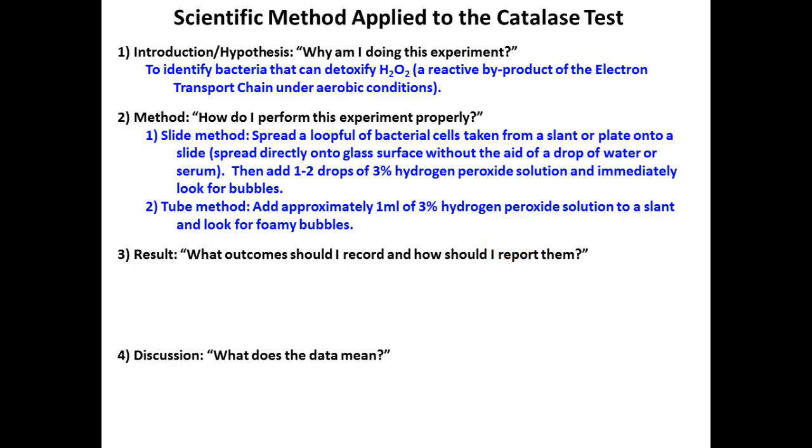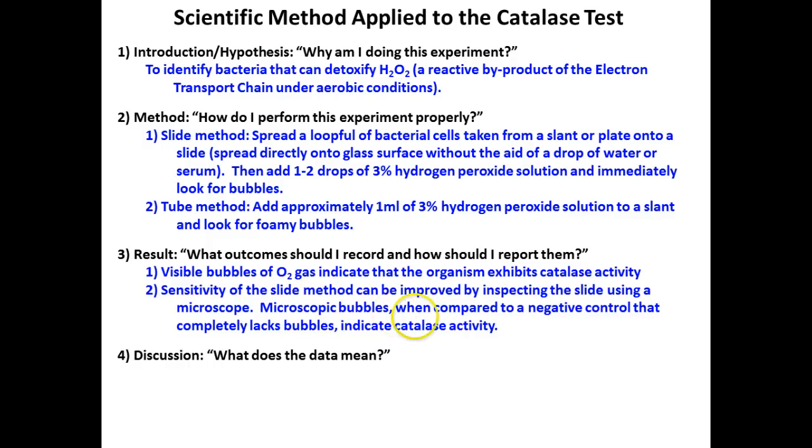Nope. Hydrogen would be dangerous. Oxygen and water. So it's oxygen gas, because it's in the form of a gas. That's why you get the bubbles. So that's the visible result.